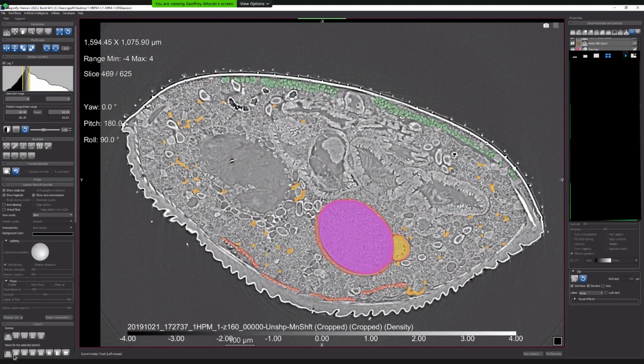But then when I loaded up another volume from which those slices had been drawn, it wasn't able to make any predictions at all. I see. It worked well on the 5 slices training set, but it didn't work well for the other slices. From the original volume, it just painted everything as background and didn't label any of the oenocytes.